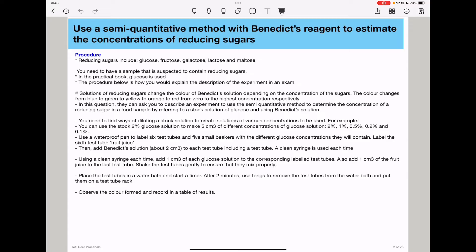You need to begin by finding ways of diluting the stock solution. For example, in your practical lab book, they give a stock of 2% glucose solution, but you can dilute that to get a 1%, a 0.5%, a 0.2%, and a 0.1% solution. In this experiment, you need to have 6 test tubes as well as 6 beakers. Use a waterproof pen to label 6 test tubes and 6 beakers with the different glucose concentrations they will contain, and label the sixth test tube for juice, because that is going to contain the sample whose reducing sugar concentration you want to estimate.